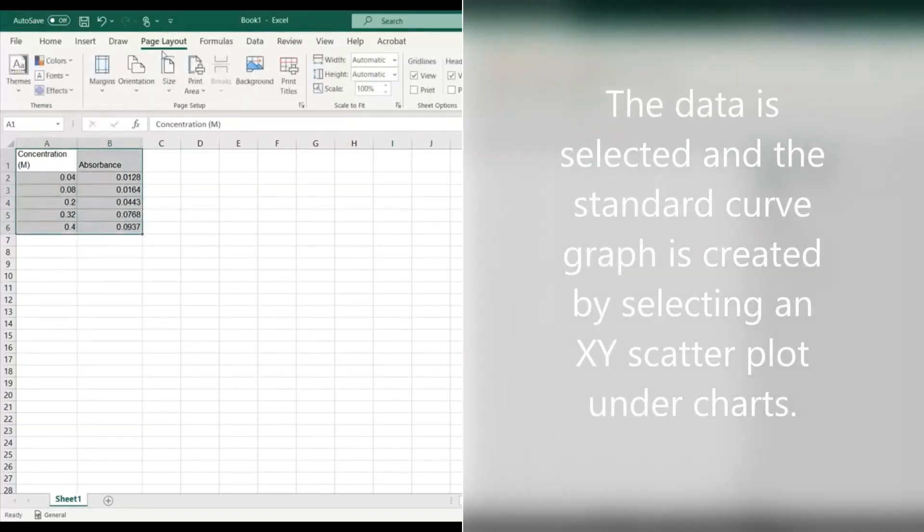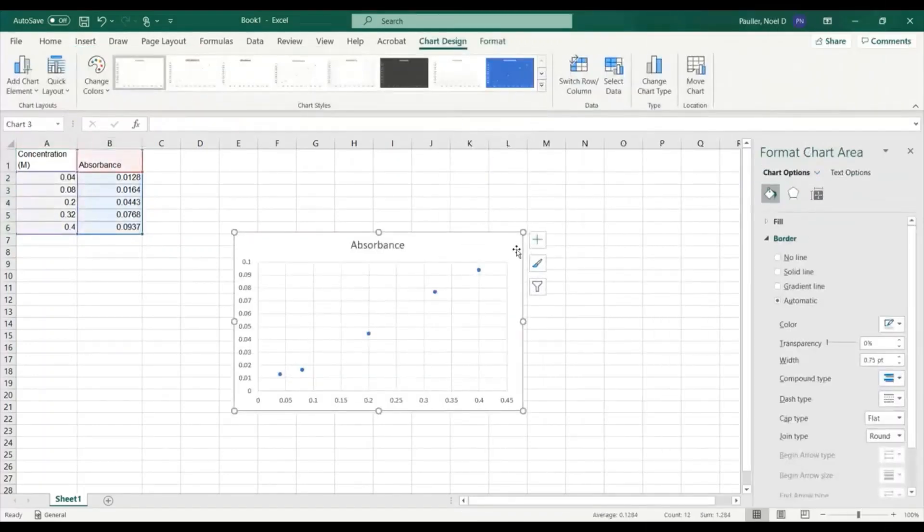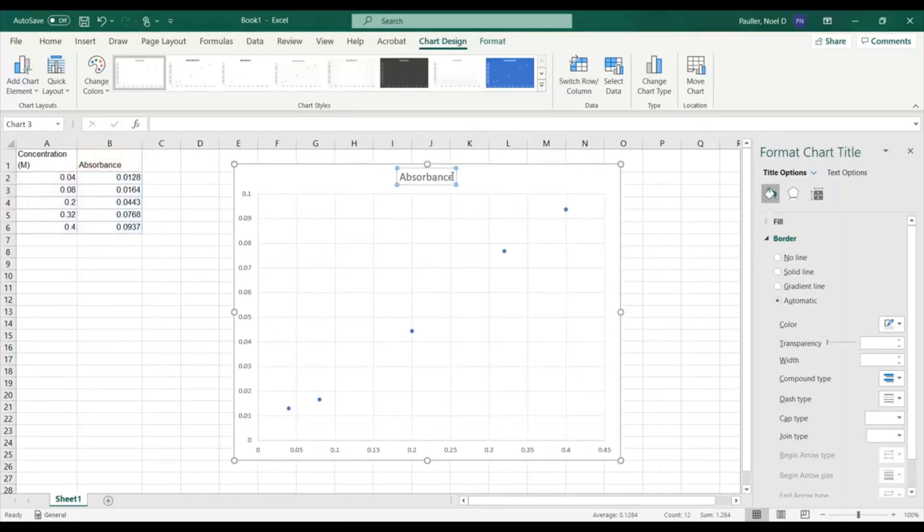So I'm going to click and highlight my data and then I will insert a chart. I want to do an xy scatter plot. Here you can see that we're able to resize the graph and I can change the title if I want to do that.